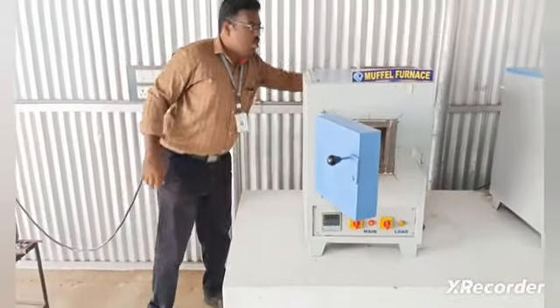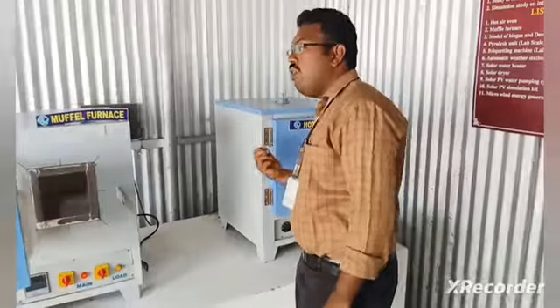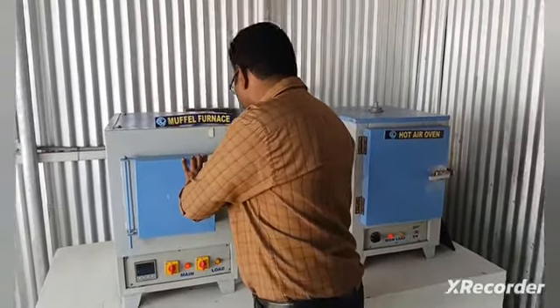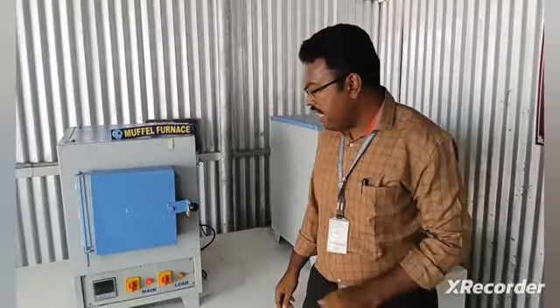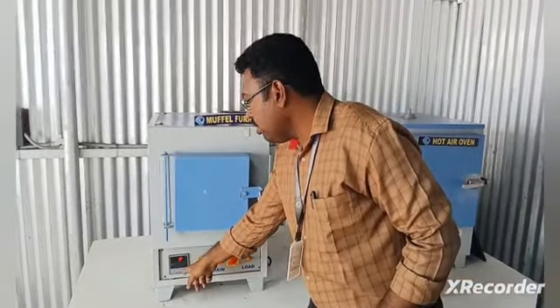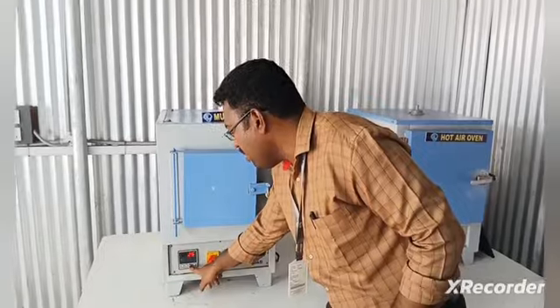First we are going to switch on the muffle furnace. We keep the biomass material which was taken from the hot air oven in the muffle furnace using a ceramic container. After keeping this, close the muffle furnace door, and we can switch on here. Making this on, we have the temperature indicator. Using the set value, you keep the temperature. Now it is 25 degrees Celsius. The required temperature we can change from here.